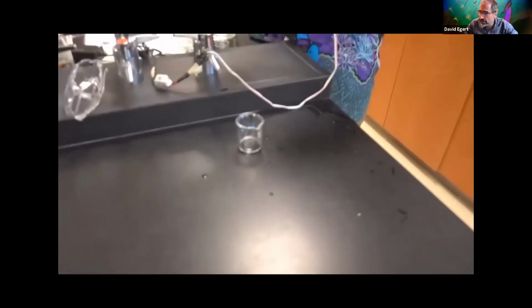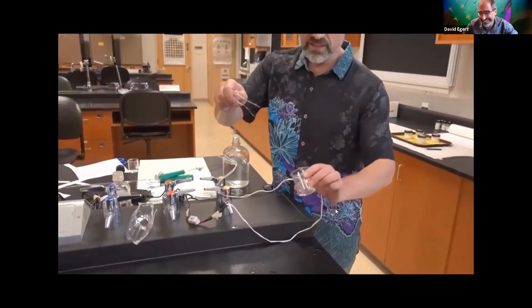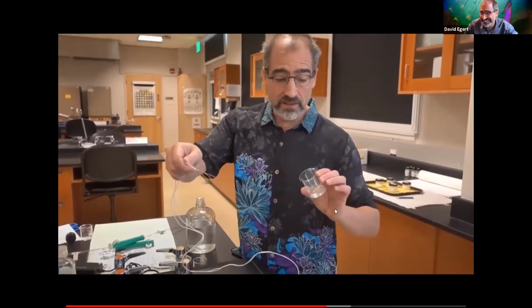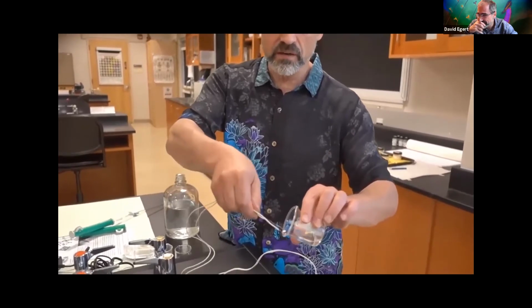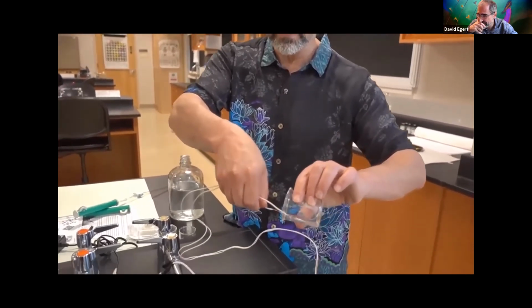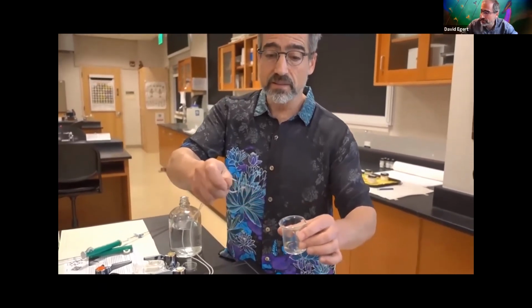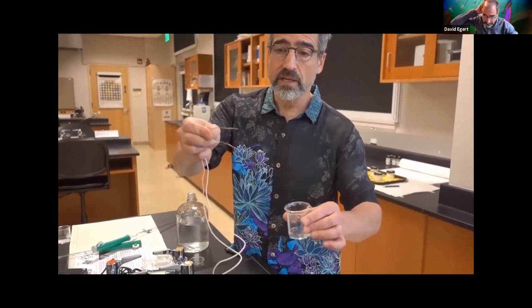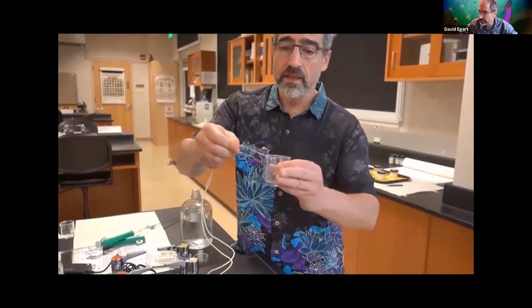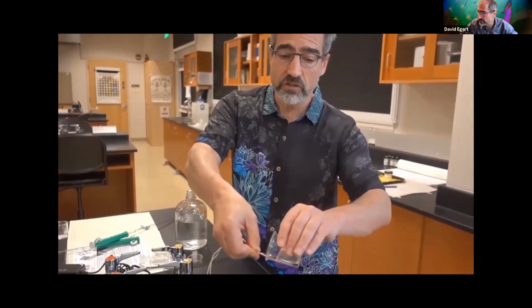And then we can look for the continuity. We put the wires, and they don't make a current in the air, but if they are submerged under the potassium chloride, I can hear a buzz. So again, I'm kind of in parallel, so they're not touching. Want to make sure that there's a large surface area submerged, and sure enough.